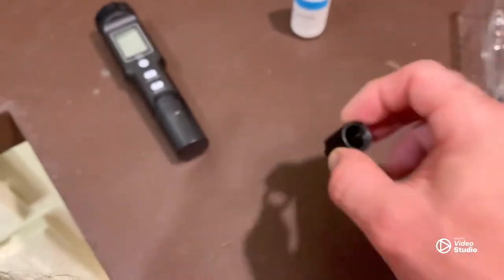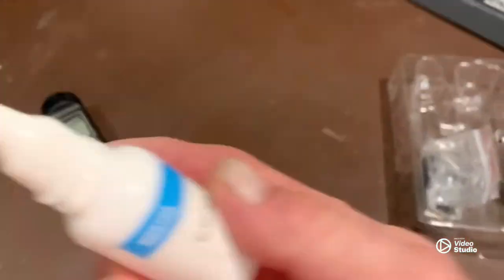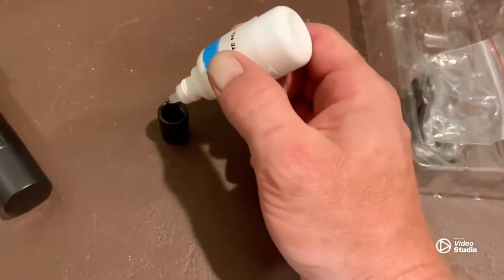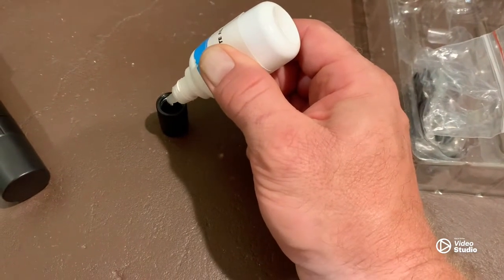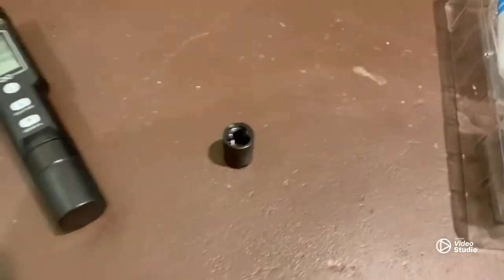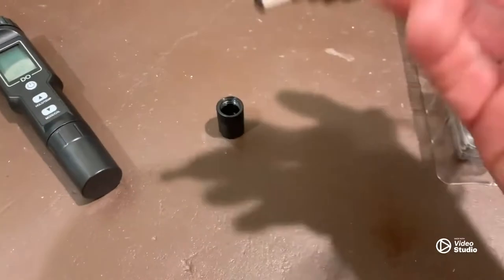Here we have our little membrane cover. You're going to want to take some of the electrolyte solution, give it a quick little shake, and put about a third to a half into your little cap there. Then this will go on it and you will screw it back on.